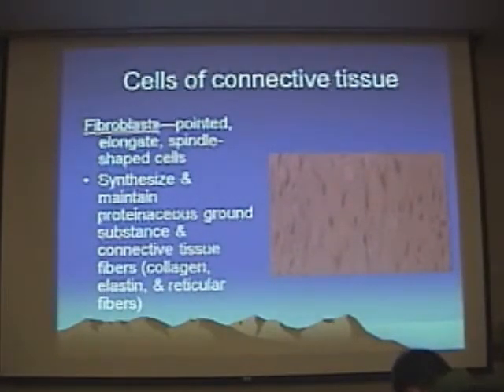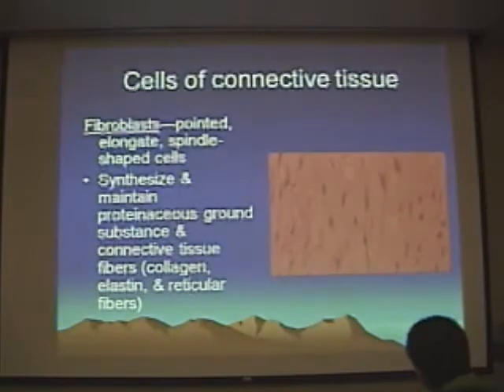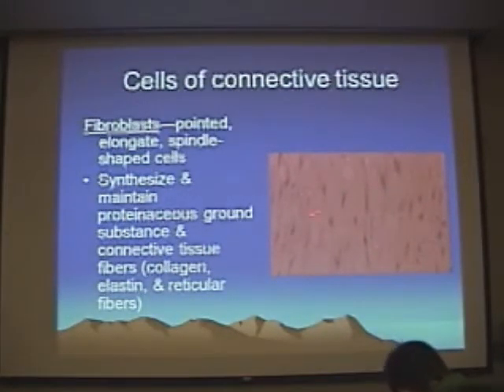But they also produce various fibers within this extracellular environment. The most common of these are different types of collagen, but they also produce things like reticulin, elastin, and all that good stuff. So when you look at connective tissue, you have these cells that are loosely packed, interspersed with all this other stuff, which may be variously packed. And because everything stains pink, it's often difficult to distinguish the cell boundaries from the matrix itself. So usually what you see are these long spindle-shaped nuclei, which represent the fibroblasts. And then this matrix material is variously granular.